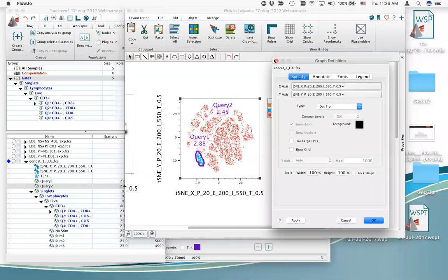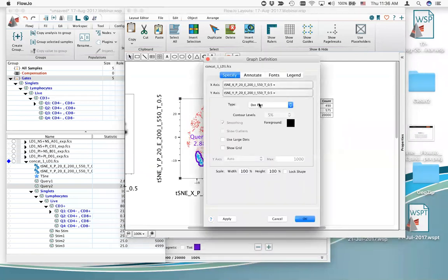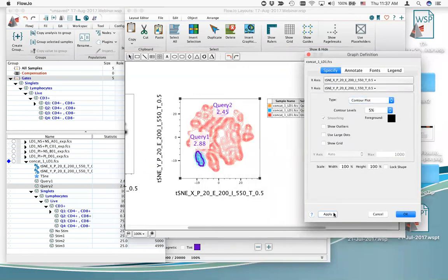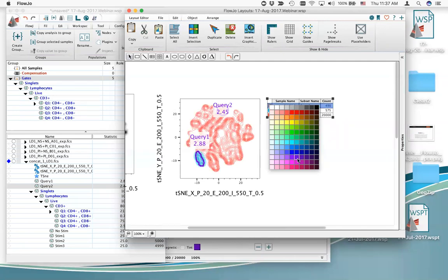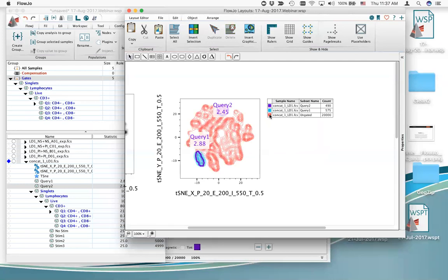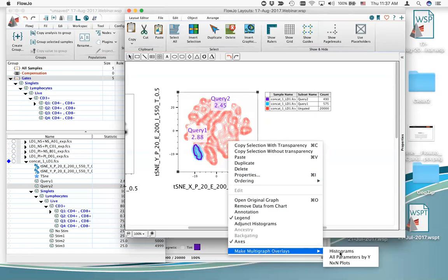The default is a dot plot overlay, but right-clicking and going to properties in the layout editor graph plots lets you change to a different plot type. I like looking at these as contour overlays — you can see different colors for each query gate. Right-clicking on this overlay allows you to select 'show multi-graph histogram,' which shows a histogram profile of every parameter in the file for each population in the overlay.